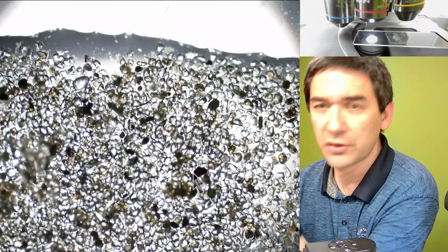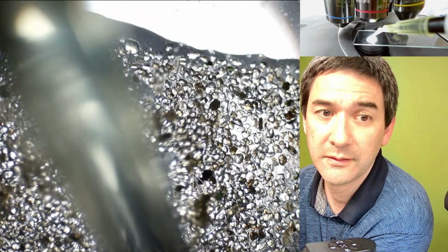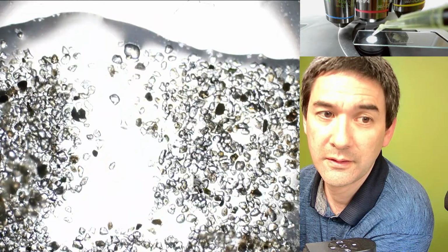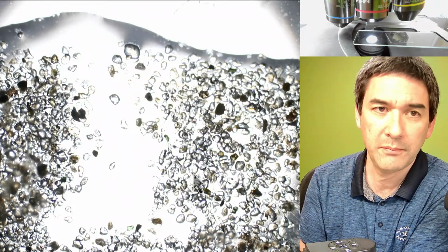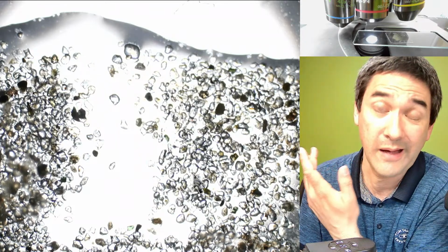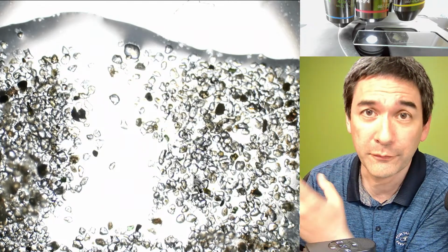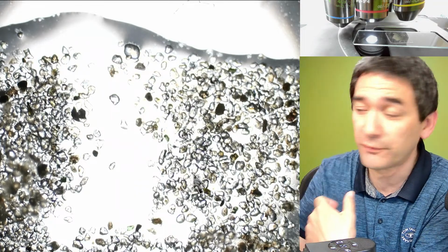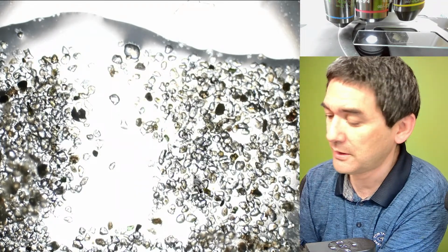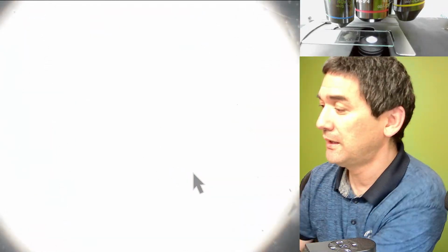So what you can do now, check what I'm doing. You kind of go in with a pipette like this, and you can try to actually, yeah, it actually did work. You can try to pick up individual things. I've picked up tardigrades this way before, simply to separate them from all of the other mess, algae, sand grains, and so on that surround them. And I transfer it over into, I'll just show you, a different empty place here. And then what I usually do is I go here again.